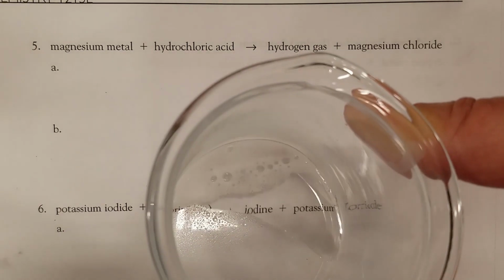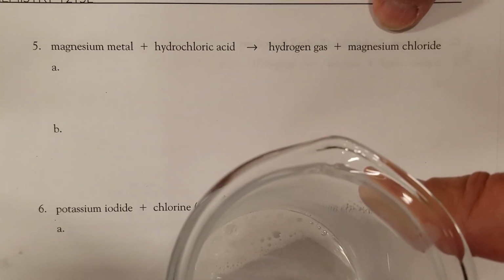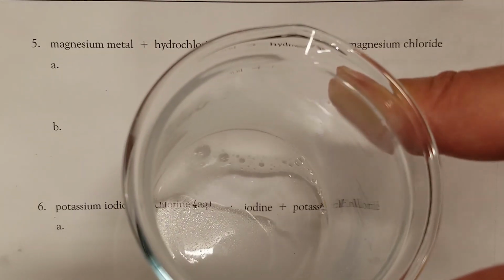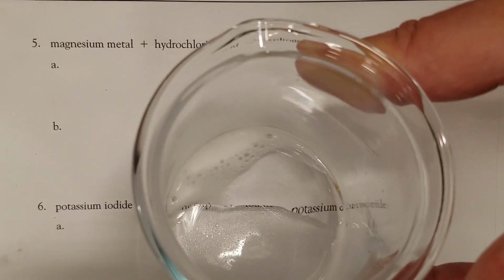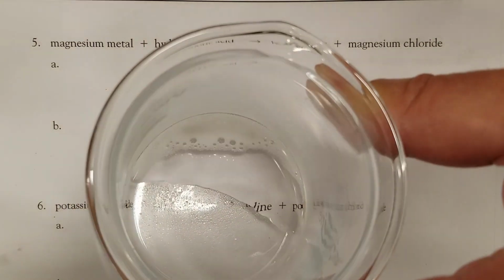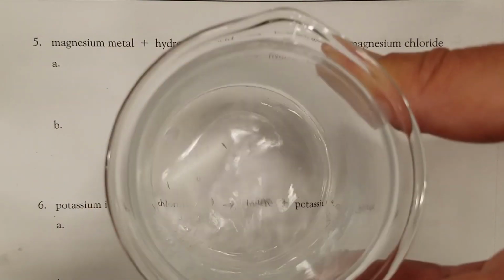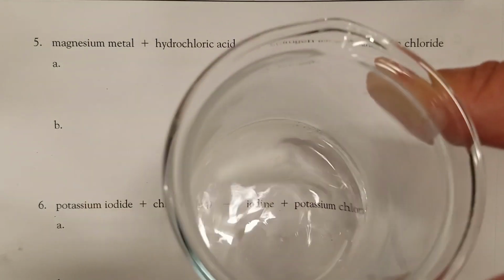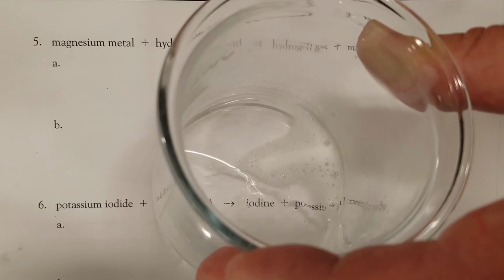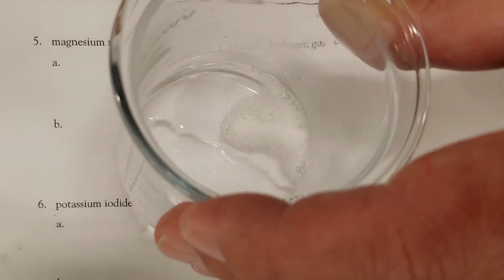The magnesium's of course turning into magnesium chloride. So acids, as advertised, they chew up and destroy and dissolve metals. And let's see, any magnesium strips left in there? One lonely one left.